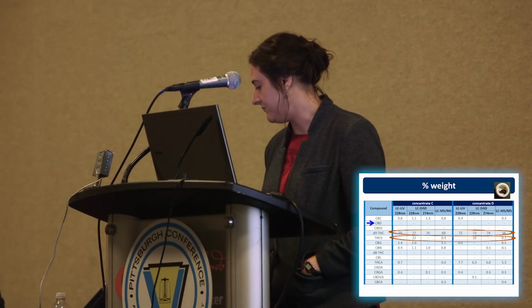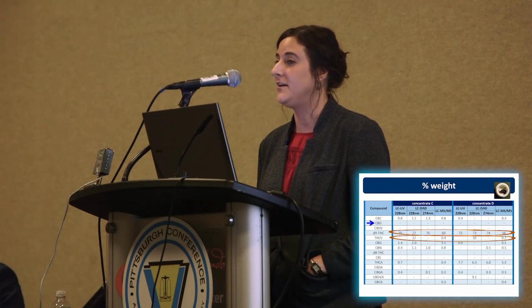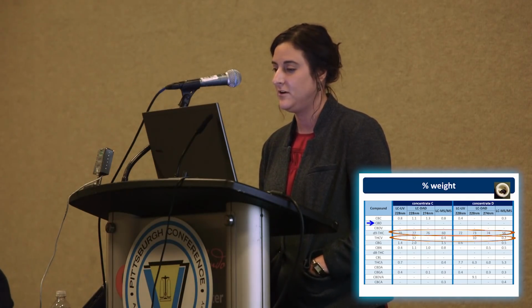We also did some CBD isolates, which I didn't report here. That's something that's supposed to be 100% CBD, and they did test in the high 90s, and with LC-MS-MS we did see it drop a little bit, so very similar to this Delta-9 THC situation.